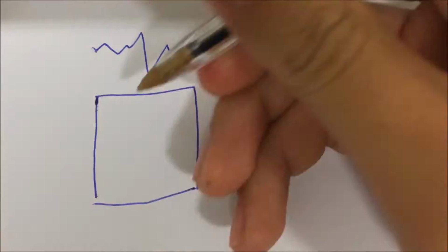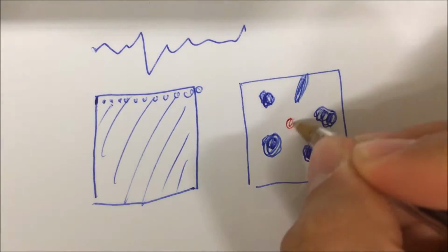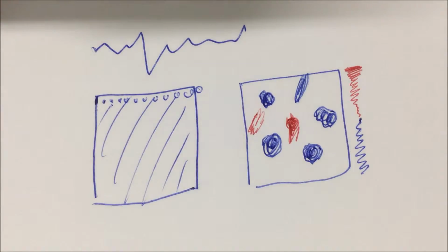Since a fixed current makes the tip move up and down as it scans, we can also generate an image with the topology of the sample, with lighter areas being peaks and darker areas being holes. This is important because it can give us a picture of the sample and can be used to determine if there are any inhomogeneities.